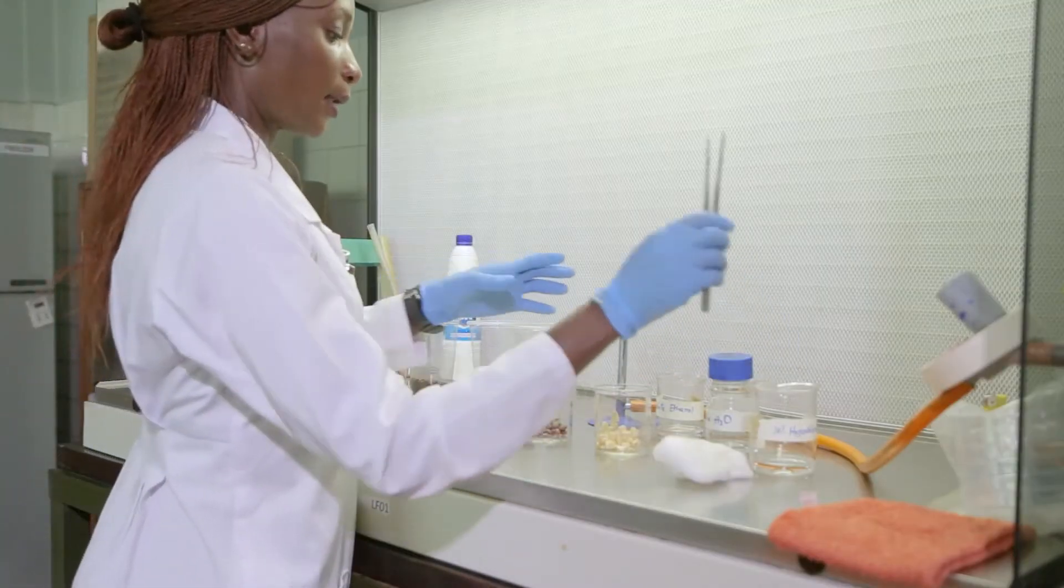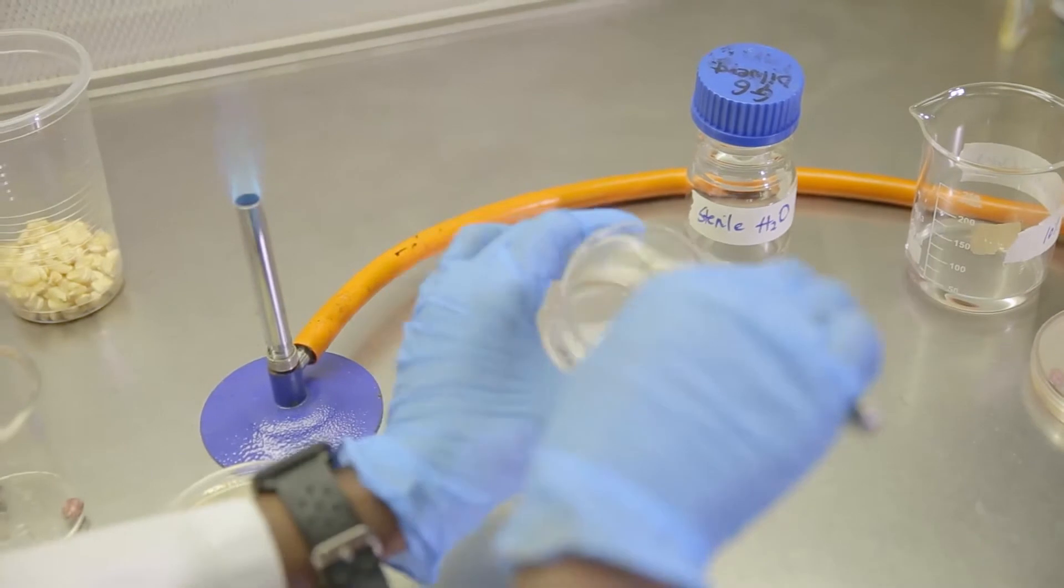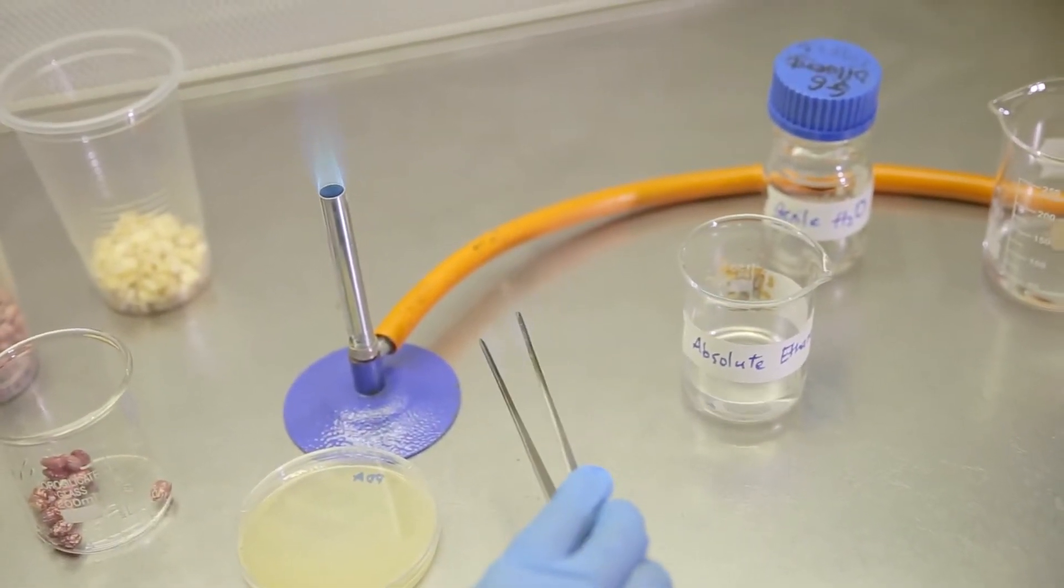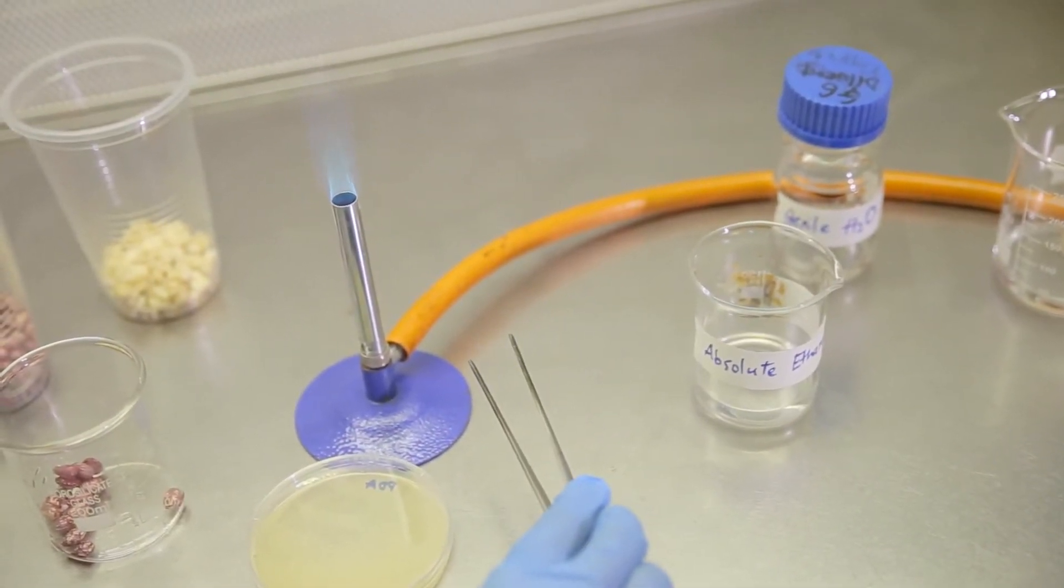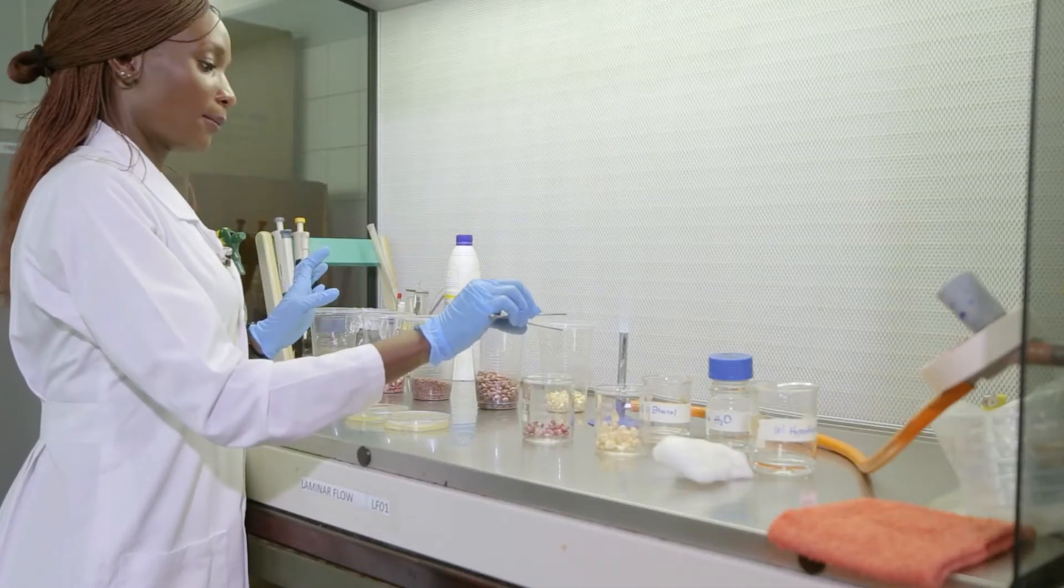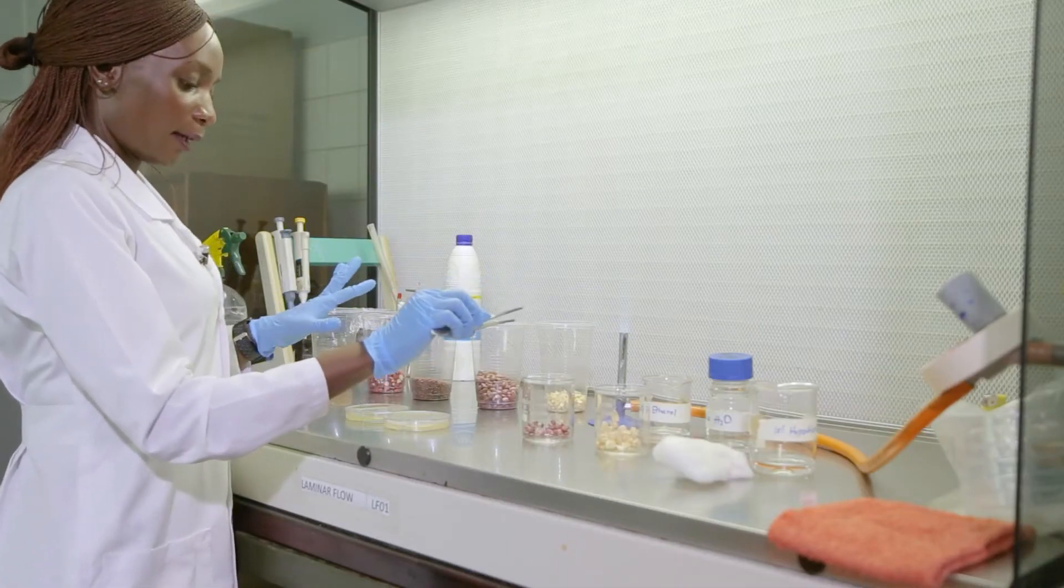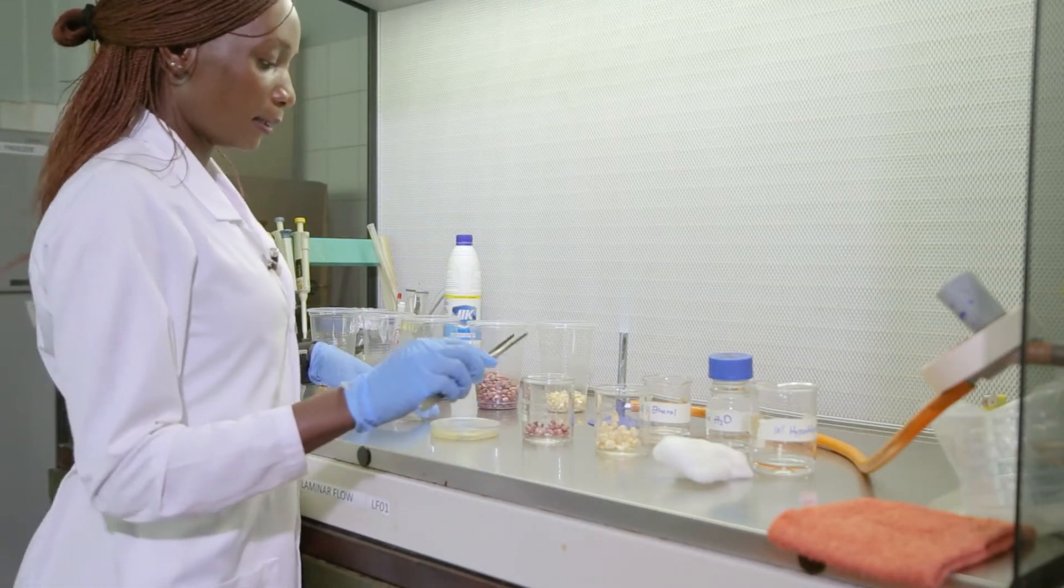So having done that, I get a pair of forceps and I sterilize it. I have dipped it in absolute ethanol and quickly pass it over the flame. This helps to disinfect my forceps such that if I have any fungi growing, they are coming from the internal parts of the seeds.